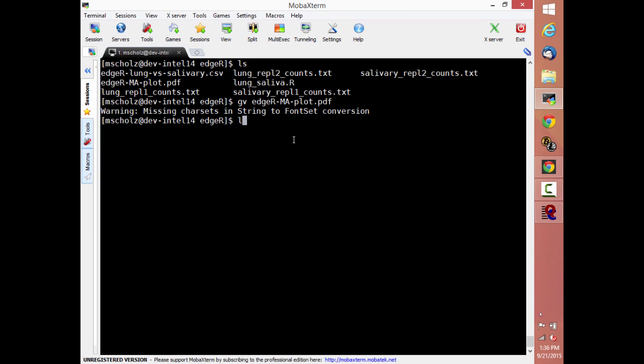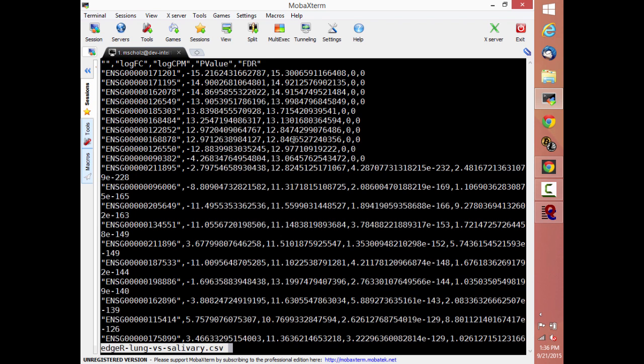So the other thing to look at is the actual outputs. So that's what you show the person who is on your back asking you why you haven't done any work in the last week. And you say, well, I've been looking at this chart and trying to figure out what to do with it. You can try to figure it out if you want. And then while they take a look at that, you can actually look at the table, which is important.